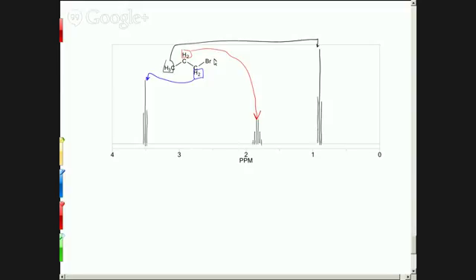Okay, so we've got to piece this thing together. Now we know that there are a lot of different ways that we can draw a structure for C7H14. There are many different isomers of that, right? And we could draw some. So you could have your double bond over here. You can have it branched somehow. There are tons of isomers, many, many possibilities. This is just telling us that we have to put a double bond in there. So we can use the NMR to determine how we're going to design this structure. Because there's so many different isomers, we can't just figure it out by drawing isomers. We use the NMR.